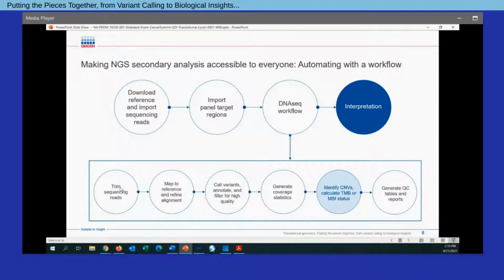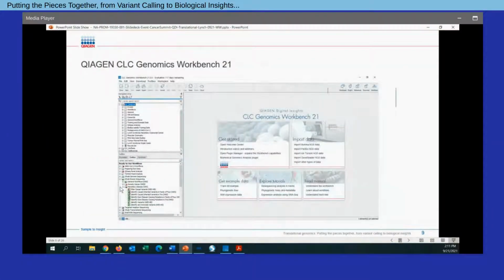So really, the software itself is a very flexible platform. The workflows that we're going to discuss today are those that can be utilized out of the box with the software, but they also offer a degree of customizability as well. So really what I want to walk you through within the software briefly today is the key steps to generate our set of called and accurate variants through CLC Genomics Workbench. And that's going to involve, again, a few main steps. First of all, downloading necessary reference information.